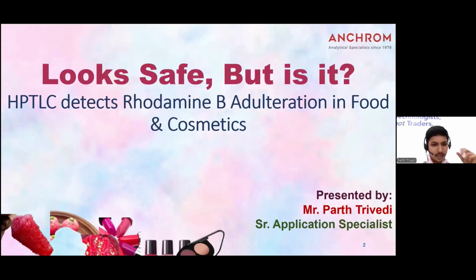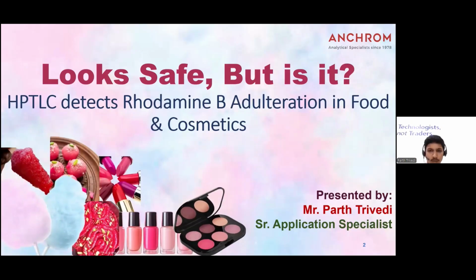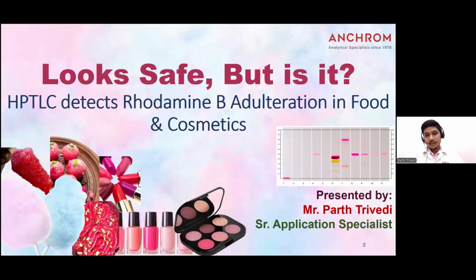As these images are coming up, what is the common thing you are seeing in these images? All the bright colors. Look at these foods, they look so tempting, and the beautiful cosmetics look attractive, but they hide toxic danger. With the help of HPTLC, we'll find out the presence of rhodamine in food and cosmetics, like in the image.